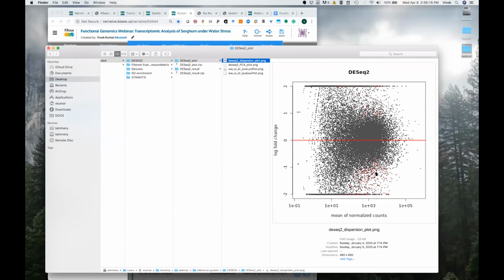And then the ones in red are the ones which are significantly expressed for that cutoff, 0.05, I believe, in this case. So it gives you some insight into, again, if there's any distortion in the underlying data for 2 samples at a time, you can see it. So in this case, obviously, more or less, it is somewhat symmetric. So it's good to go.